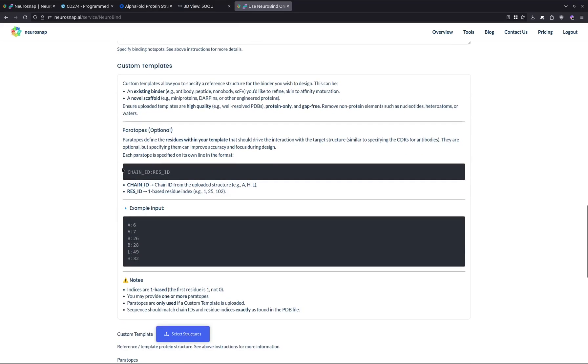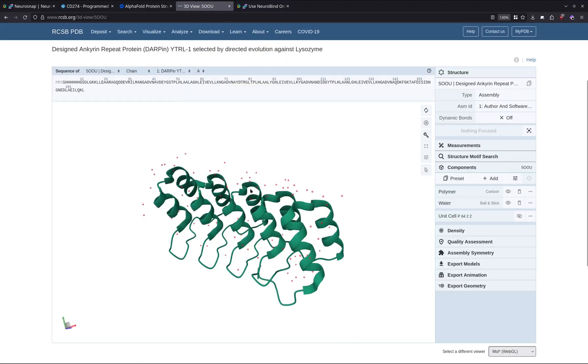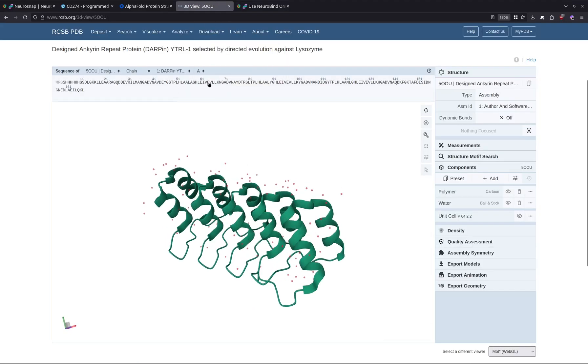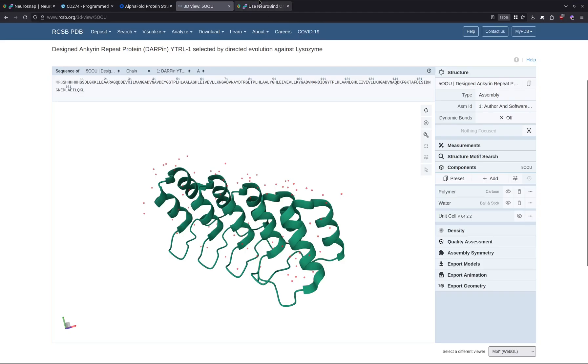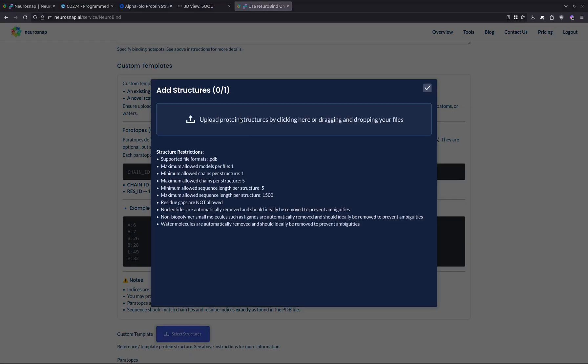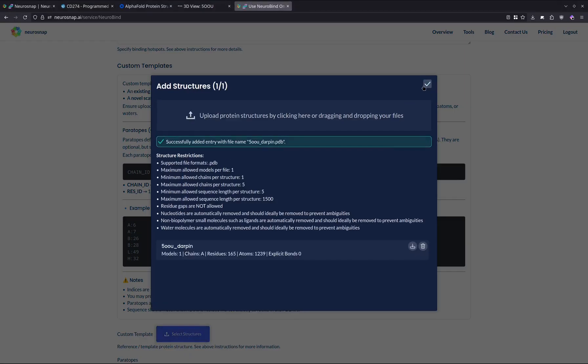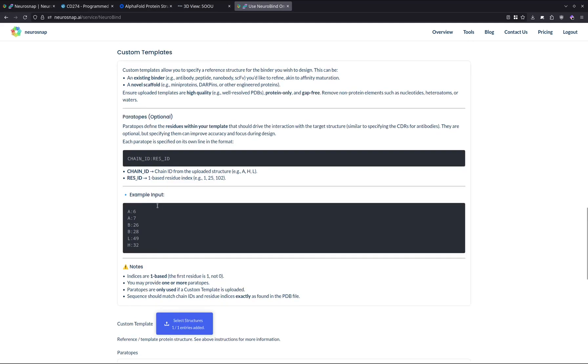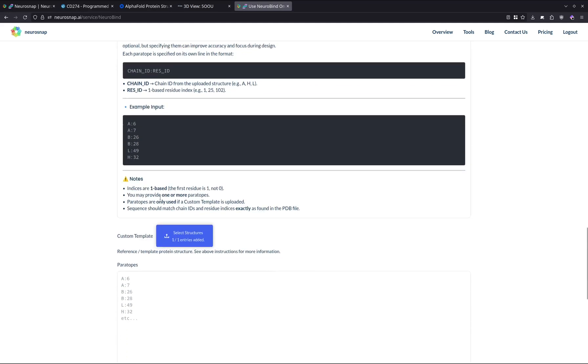Now the next thing we have is the custom template. In our case, we're going to be uploading this template, DARPIN 500U from the PDB. Then we can just upload the structure over here. I already have the structure downloaded, I can just enter it, and we're good to go.